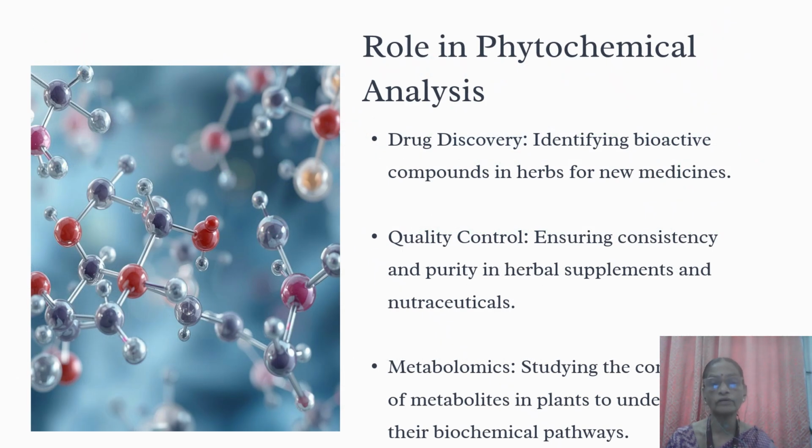Phytochemical analysis is mostly used for the drug discovery process, that is, identification of bioactive compounds from herbal medicine for the generation of new medicine. It also ensures the consistency and purity of herbal matter, thereby the quality control of herbal products as well as herbal supplements and nutraceuticals can be determined.